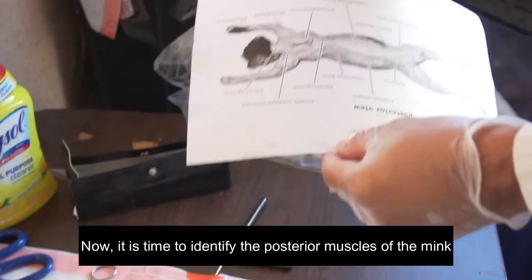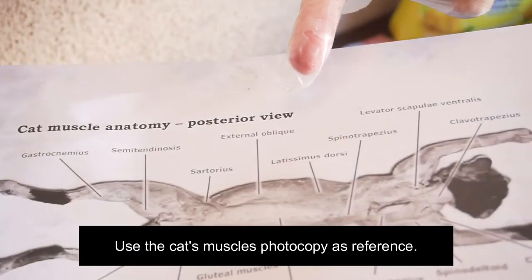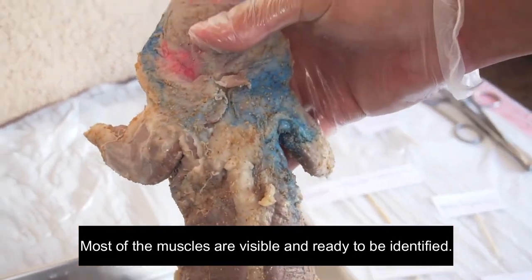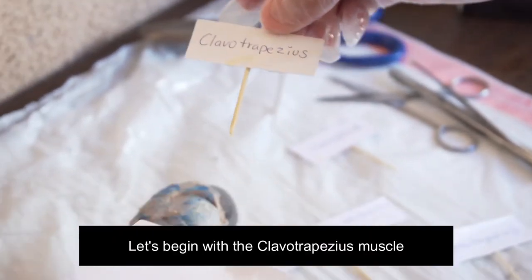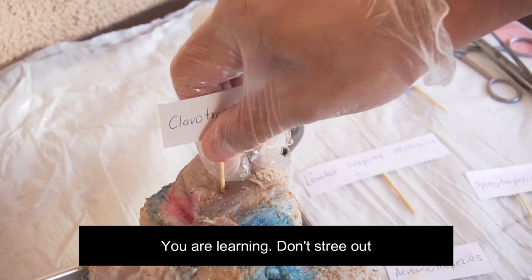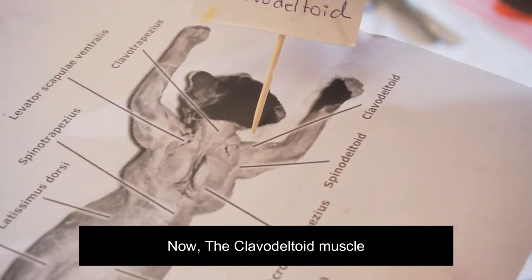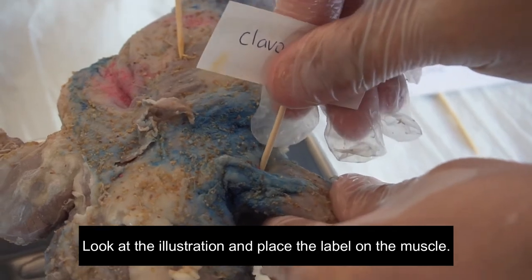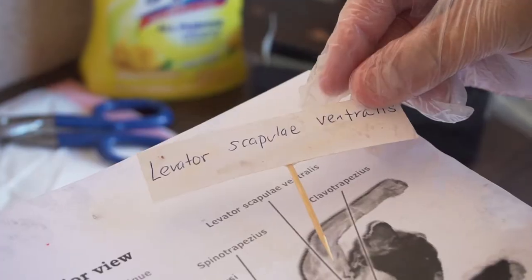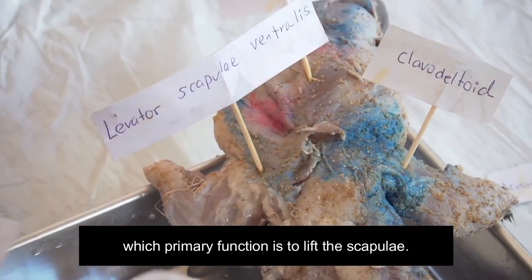Now it is time to identify the posterior muscles of the mink. Use the cat muscle photocopy as reference. Most of the muscles are visible and ready to be identified. Let's begin with the clavodeltoid muscle. Try to be as careful and accurate as possible — you are learning, so don't stress out and enjoy the process. Now the clavodeltoid: look at the illustration and place a label on the muscle. You could use a dissection needle to do some incisions to place the label. Next muscle is the levator scapula ventralis, whose primary function is to lift the scapula.